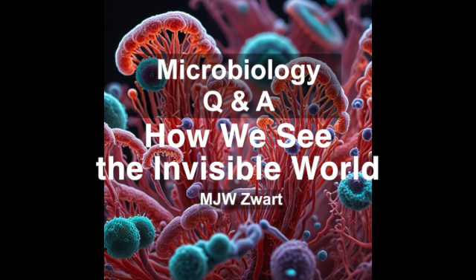But I know there's even more, right? We also have these things called scanning probe microscopes, which take us even closer to the atomic level. You're right. Scanning probe microscopy is a whole other branch of this incredible family tree. These microscopes use a tiny, sharp probe to physically interact with the surface of a sample. So they're not using light or electrons at all. Exactly. It's a completely different approach.